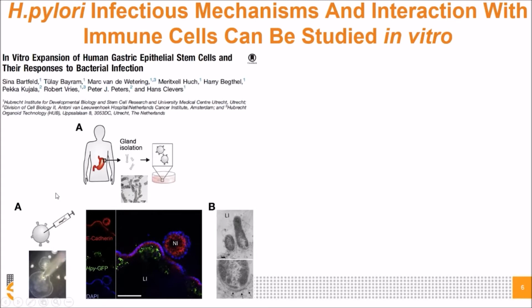In the same paper, they utilized these organoids to culture a pathogen that was not possible to culture in vitro before. Microinjection of Helicobacter pylori straight into the lumen of the gastric organoids allowed the culture of this pathogen that, as you can see here, remains very limited and confined within the organoid. They could also observe a nice interaction with the epithelium by electron microscopy.